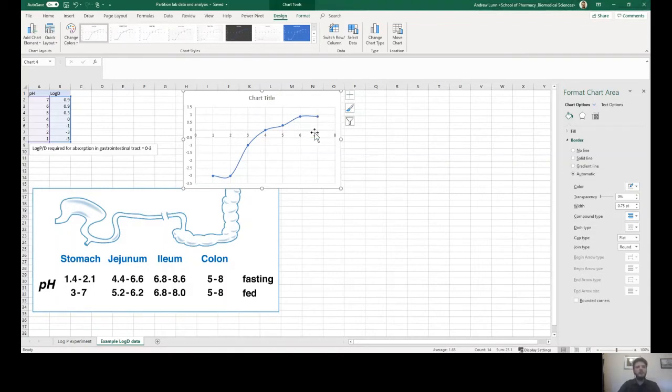And as we can see here, at pH 7 and pH 6, we've got pretty much the same data as you had before. So you found the log P for trimethoprim, which was 0.9 something. And so at pH 7 and 6, clearly this trimethoprim is in its unionized form, in this made up data. Can't stress enough that this is made up data. We can see that it's at its log P value here. So we know that it's partitioning mainly into the organic phases. But when we get to pH 5, 4, and maybe around 3, but pH 5 and 4, you can see that there's been quite a dip, and that we're almost getting a 50-50 split between aqueous and organic solubility.